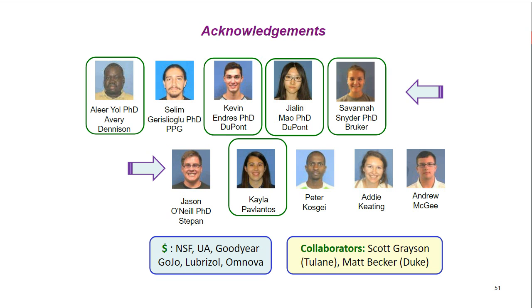Okay, we have a question related to end groups. Someone asks, what is the mass fraction required to see an end group? Or to put it another way, above what molecular weight can an initiator end group not be identified? Excellent question. That's the problem of bulk methods, that the end groups have to be quite a bit of a percentage of the mass to detect them. But with mass spectrometry, even if they are a small part of the polymer and they affect the mass, you are still going to see them.